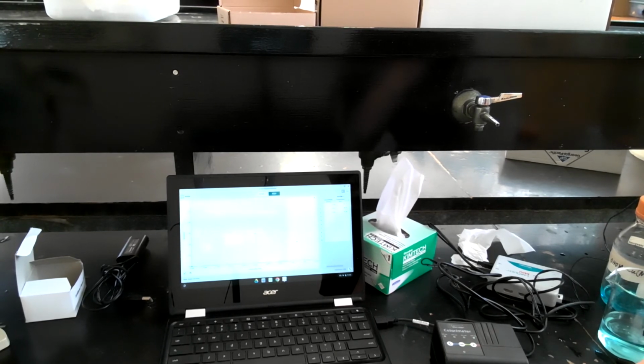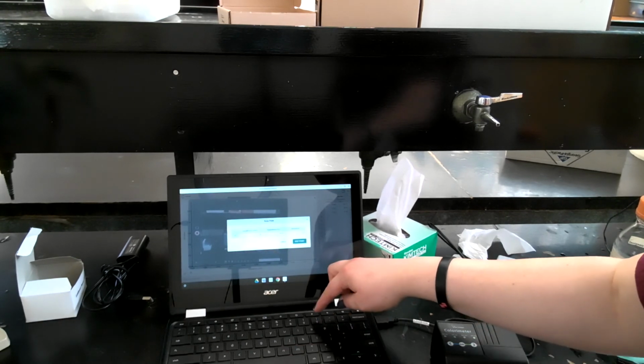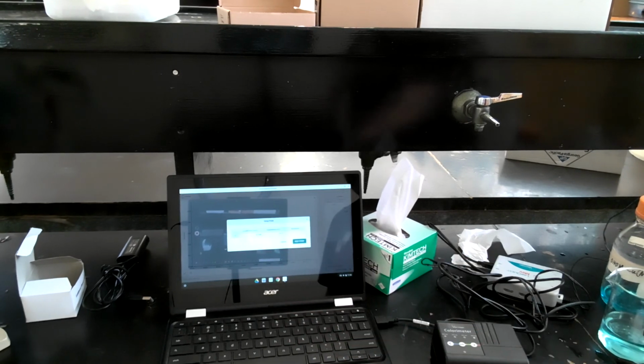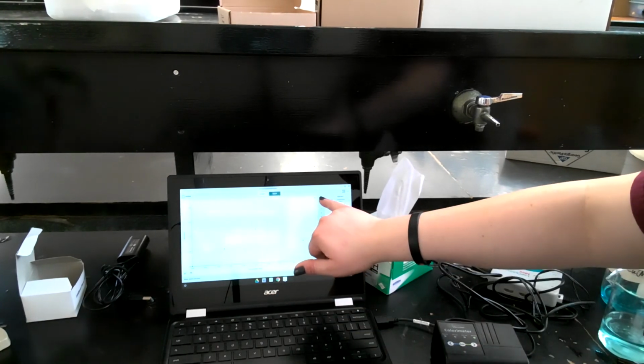It's going about 0.220 to 0.221. And it looks like it's leveling out at about 2. I'm still moving. Never mind. Okay, so it's leveling out at about 220 for the most part. So I'm going to go ahead and keep that amount. Then I'm going to type in 0.100 for the molarity. Actually, I'm just going to do 10. Okay, so there's that point all the way up here.